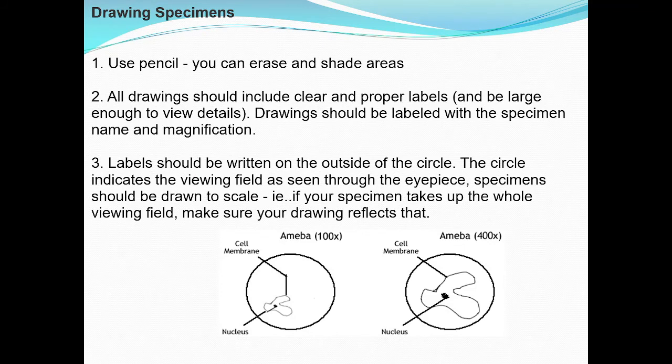Now when we're drawing, use pencils. You can always erase and shade the areas. All drawings should include clear and proper labels. Labels should be written on the outside of the circle, okay, not on the inside.